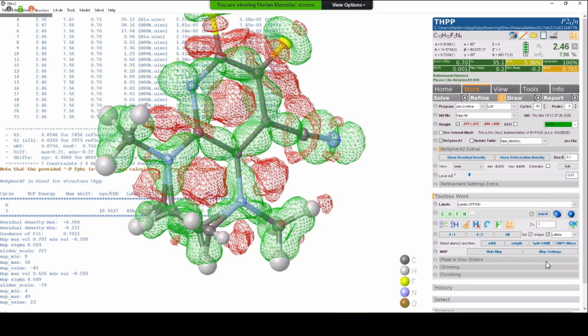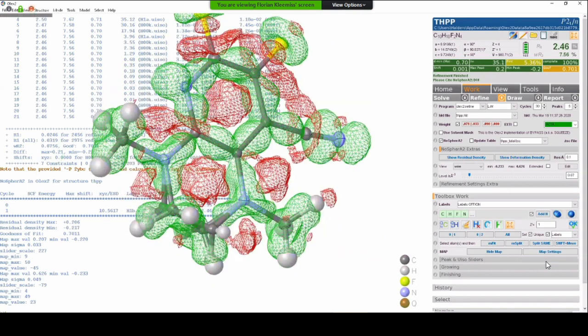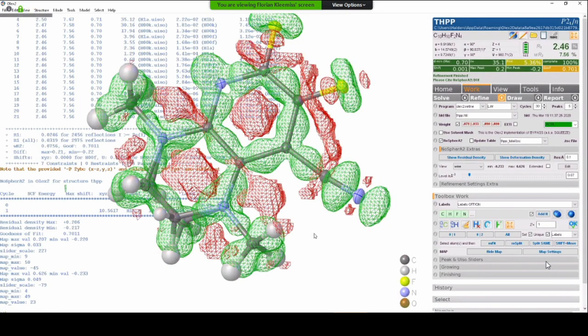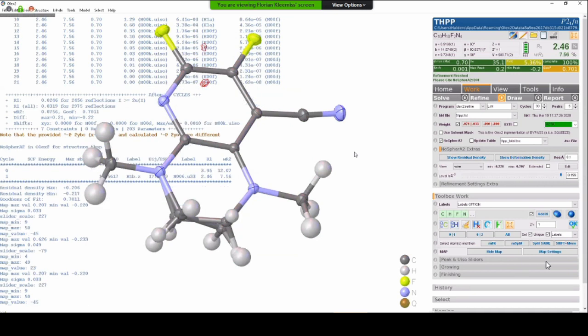But now we take away density from where the bond is not, and we put it where the bond is. So we can describe the bonding better. And this way you can look at what changed in contrast to your spherical refinement and why your residual density is gone. If you had a perfect experiment without any experimental error, the deformation density and the residual density map before Hirshfeld atom refinement should almost look identical, because this is what you describe with the better assumptions that we make.